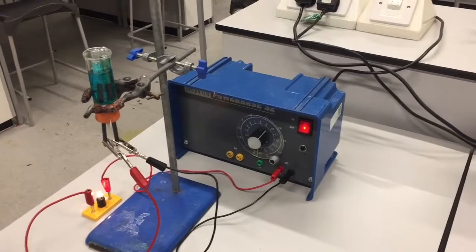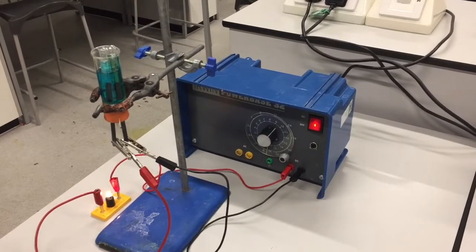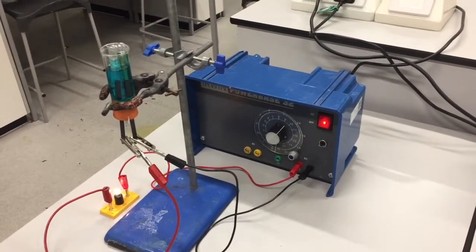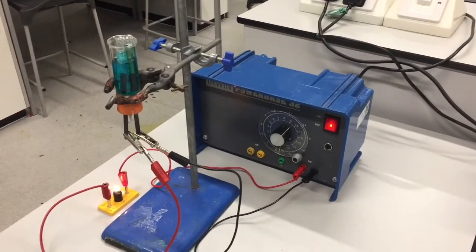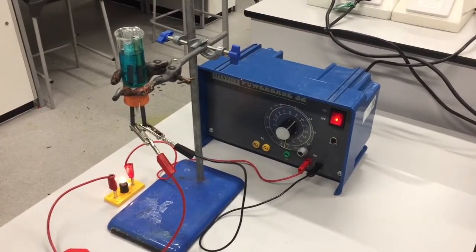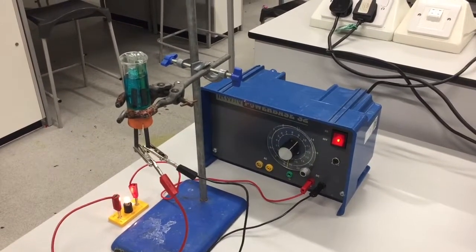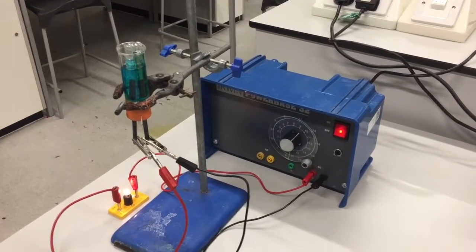And just to remember, students need to be able to draw a circuit diagram of this apparatus. They need to be able to say what ions are formed when an ionic compound is dissolved to form an aqueous solution. And then they need to predict what products are going to be produced at the anode and cathode, using those simple rules: if it's a halogen, then the halogen is produced. If it's not a halogen, then oxygen is produced at the anode. And then at the cathode, if the metal is less reactive than hydrogen, then that metal is produced, which is only going to be copper, silver, gold, and platinum. And if it's more reactive than hydrogen, then hydrogen gas will be produced.